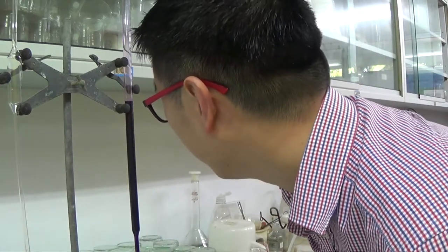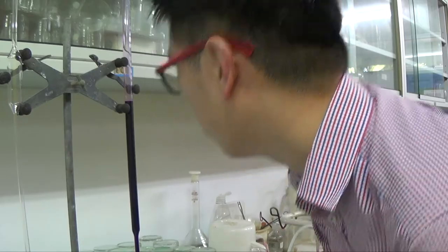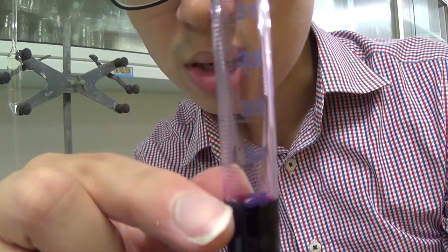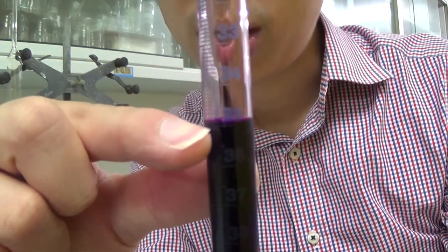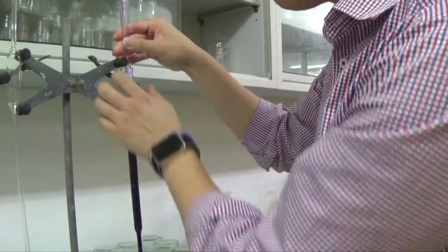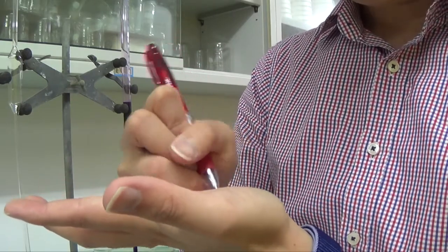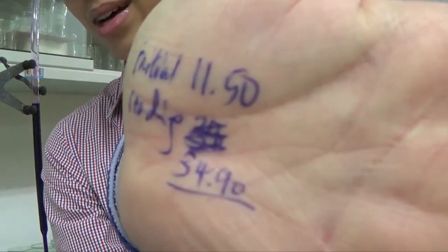So reading from above the meniscus, that gave me 34.90. Okay, so I'm holding with my hand, so this is not going to be super accurate. But as you can see, there's 34, there's 35. So 33, 34, 35, you read downward. So 34.90. Because burette reading is to 2 decimal places, plus or minus 0.05. So there's 34.90.